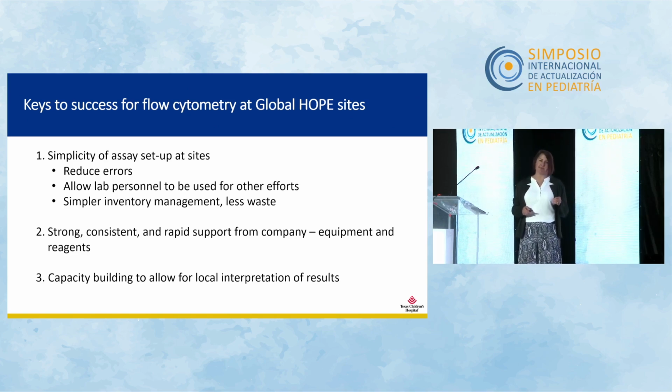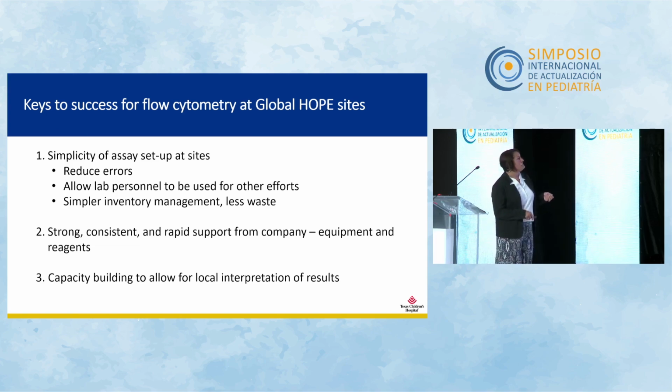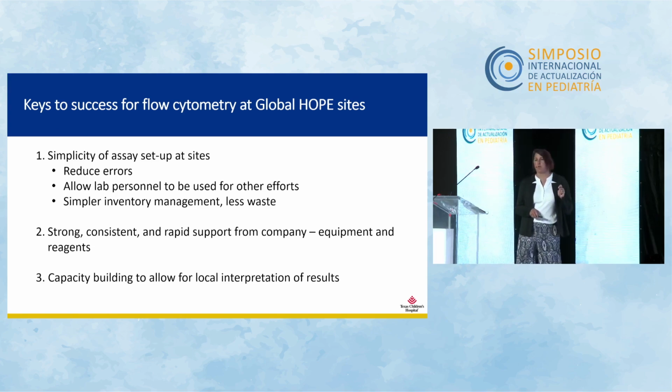I mentioned this morning how hard it is to get good maintenance and quick support. We have instruments sometimes in some countries that are down for more than a year, CT scans included, which is quite frightening when you hear the last talk, right? So we really wanted to work with a company that could support our sites well. And then we're trying to build out, as I mentioned, no hematopathologists in some countries, including Malawi. So we're trying to build up that expertise to interpret flow results and actually have it at a number of sites that can cross-cover for each other.